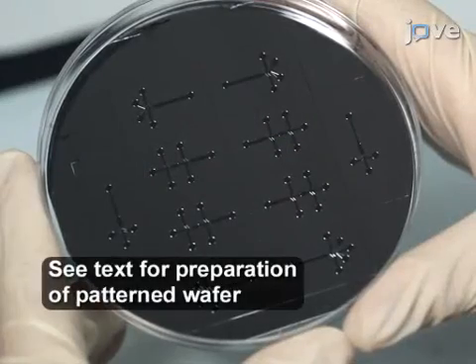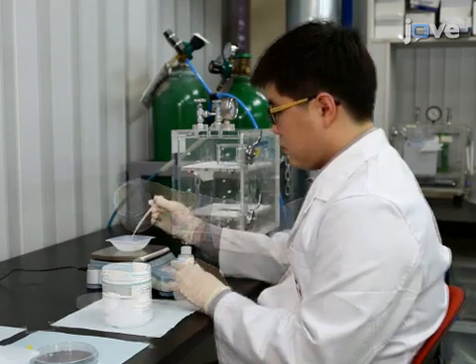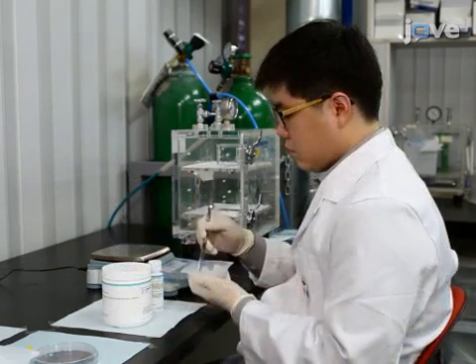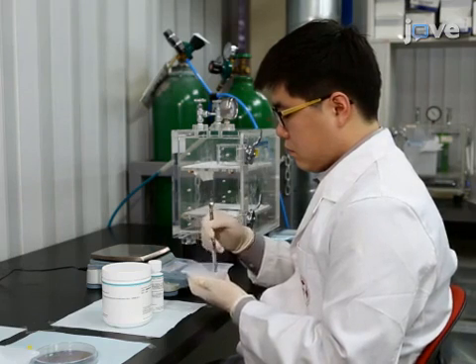Use the patterned wafer obtained as described in the text protocol as the master mold for PDMS casting. Mix the PDMS prepolymer and a curing agent homogeneously at a weight ratio of 10:1. For example, use 1 gram of curing agent for 10 grams of PDMS prepolymer.